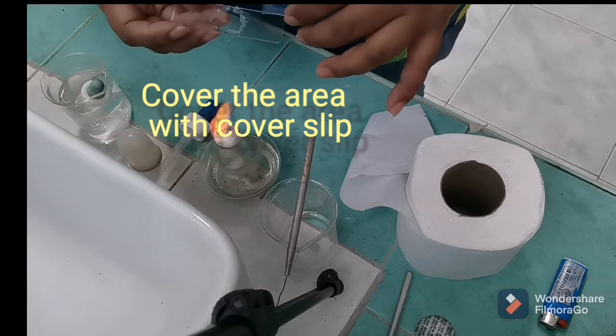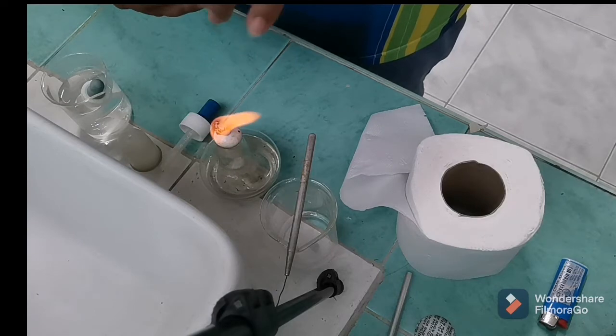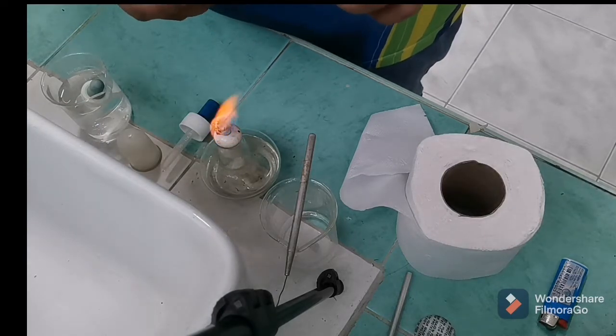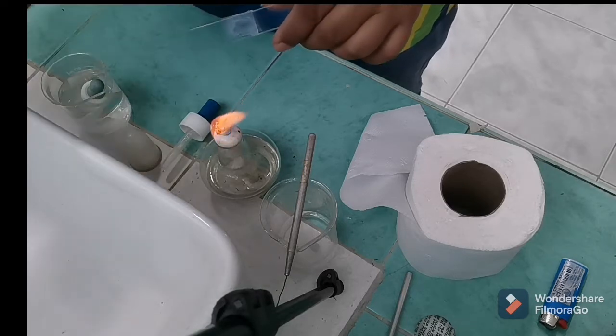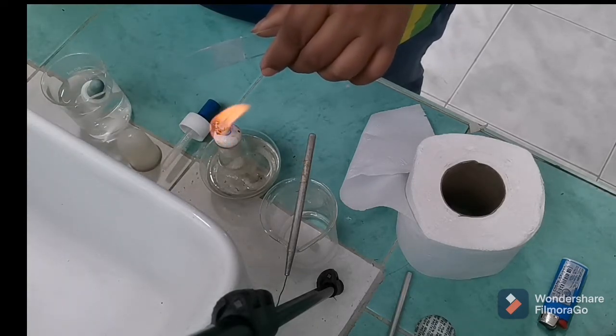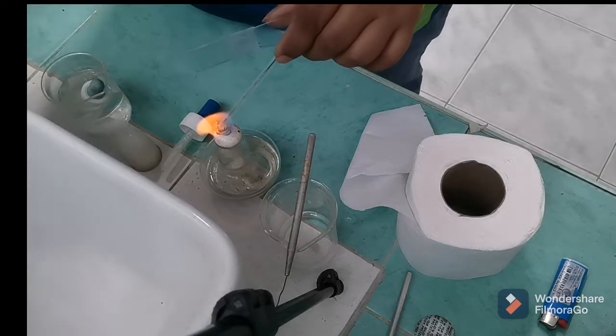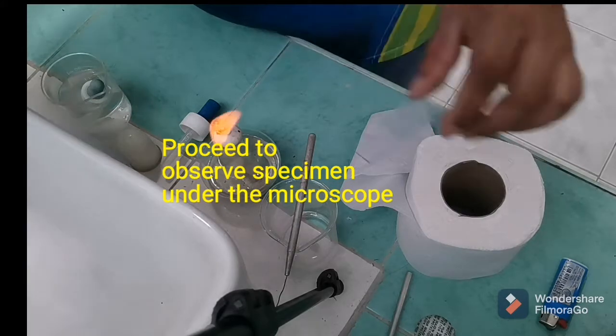It should be done in a quick and fast way. Okay, so you have there the area where the liquid will be observed. So this will be now our hanging drop method.